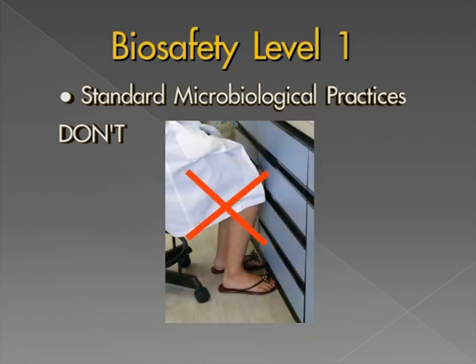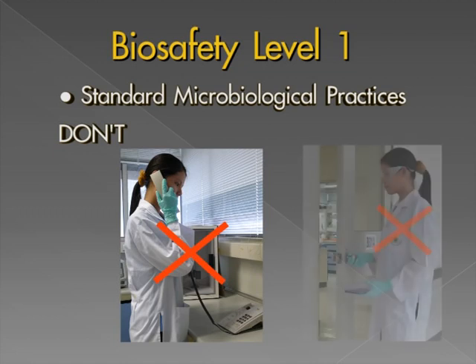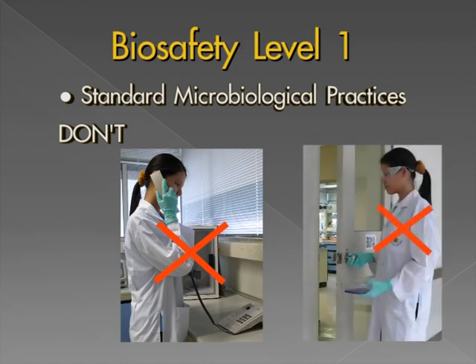No sandals. Shoes must completely cover the foot. Do not touch clean surfaces with gloved hands. Gloves should be removed before leaving the laboratory area.